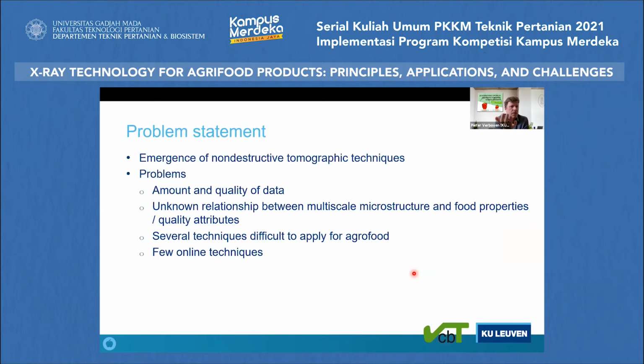Luckily, we have a number of techniques available to us that we can explore, that are non-destructive, that are tomographic. And tomography, a term I have not yet introduced, stands for three-dimensional imaging. I will explain one tomographic method based on X-rays in detail shortly. These techniques are available, but they're not directly useful because there are some problems.